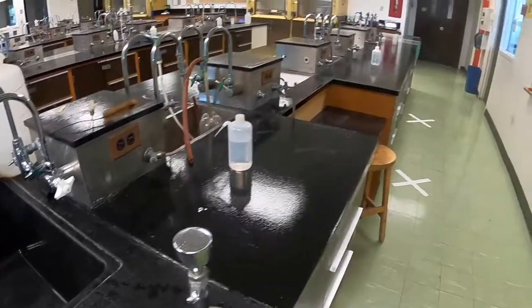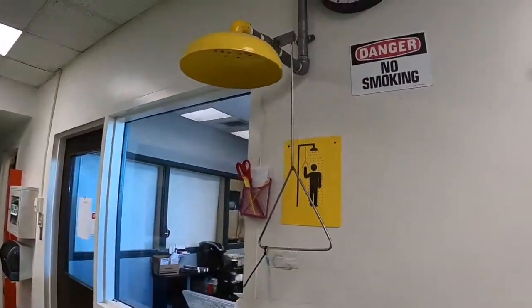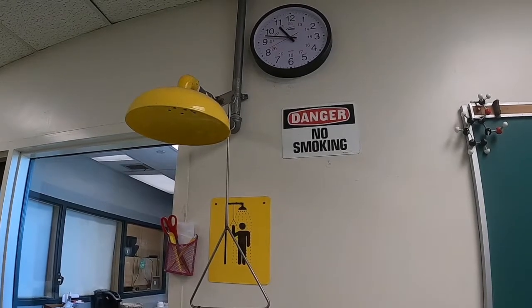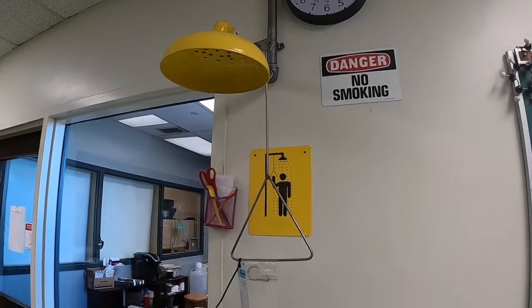Also located at the front of the room, we have a second safety shower. This one is easy to operate as well — you simply pull the triangular handle and the shower will turn on. You should note that there are no curtains and there's no drain in the floor. This has two implications: one, please try not to need this shower, because if you use it, we end up flooding the geology lab down below.